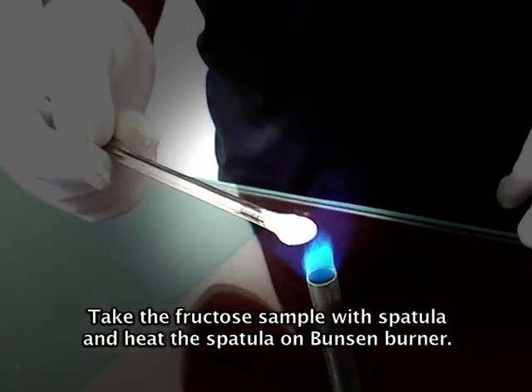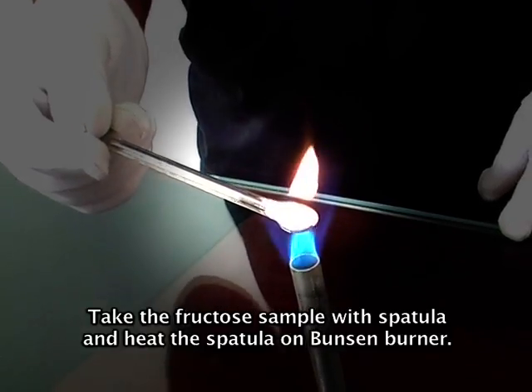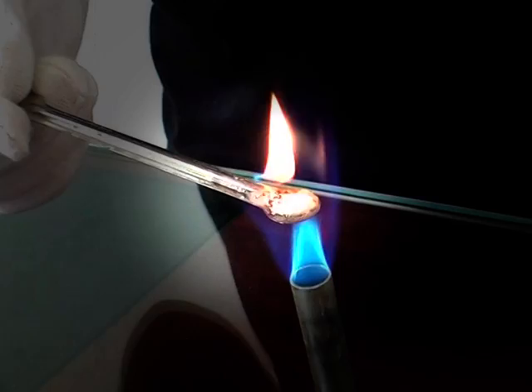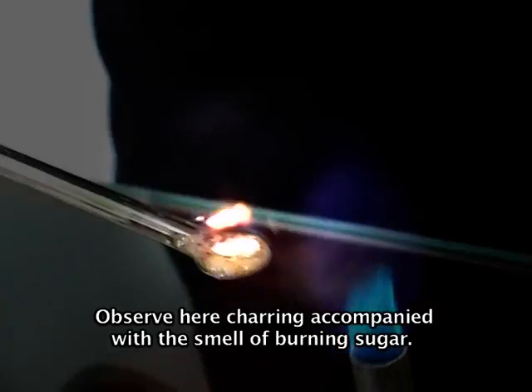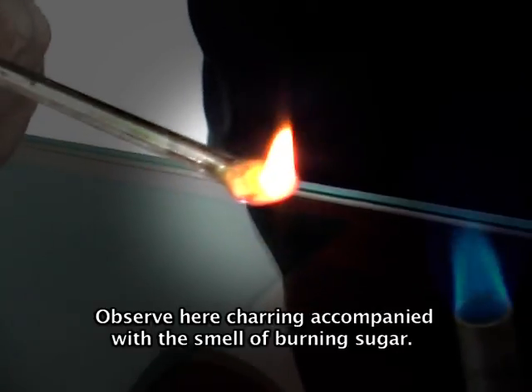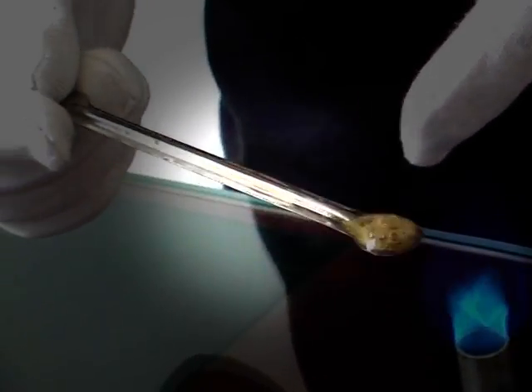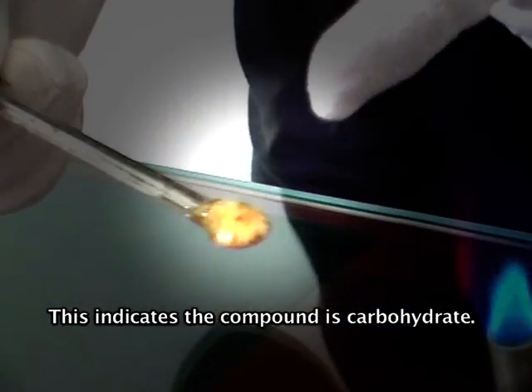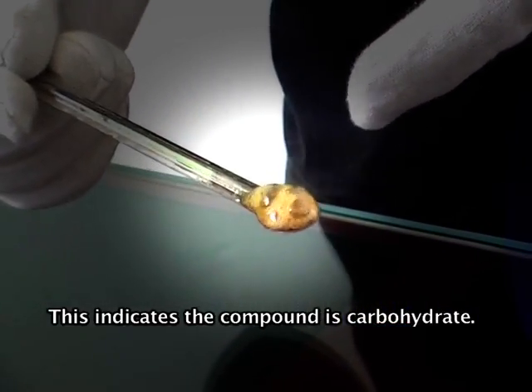Take the fructose sample with a spatula and heat the spatula on the burner. Observe here charring accompanied with the smell of burning sugar. This indicates the compound is a carbohydrate.